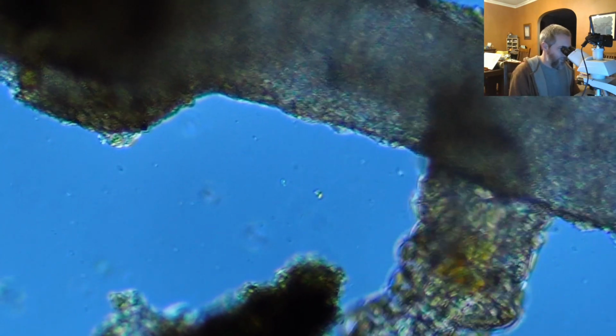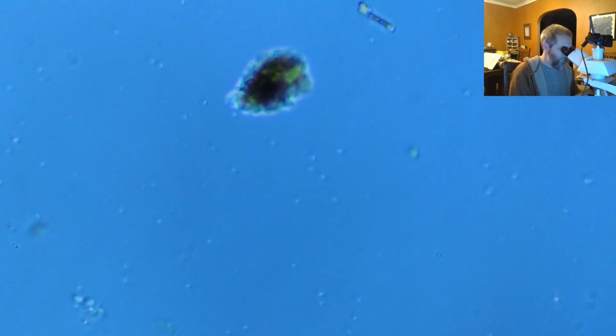We can look around a little bit. I sort of know where this guy is, so we can maybe try to find that other little guy that was crawling around in here. I know there's at least one more water bear fairly close to here, because when I started there were two of them right next to each other, in their little cryptobiotic tun states, just sitting there rehydrating.